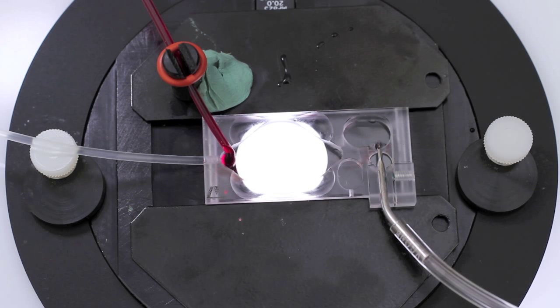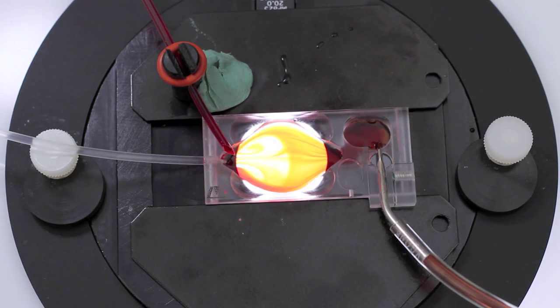Here we observe the pattern of wash-in and wash-out through an RC-26 chamber perfused at 2 milliliters per minute with the addition of a single drop of food dye. Observe the flow characteristics during clearing of the bath and the laminar flow induced by the chamber bath geometry.